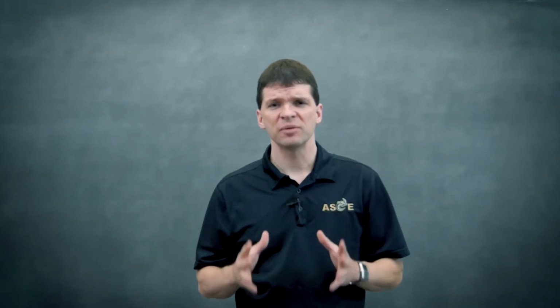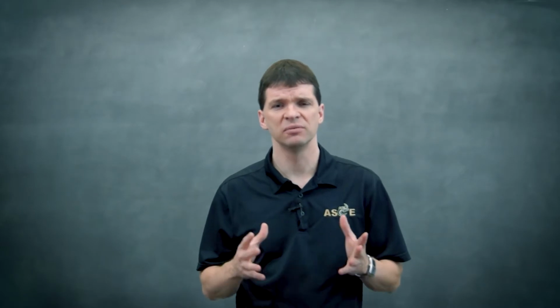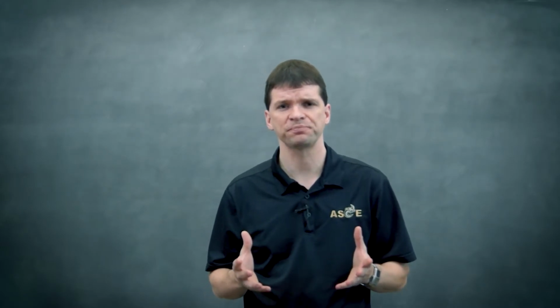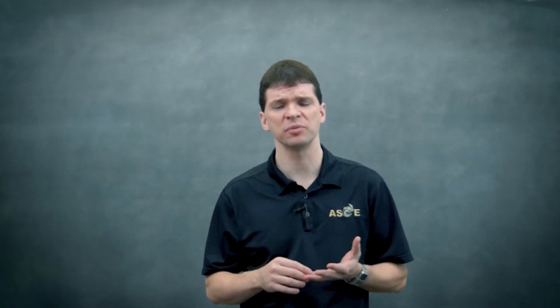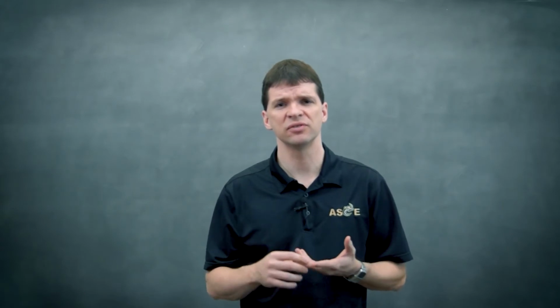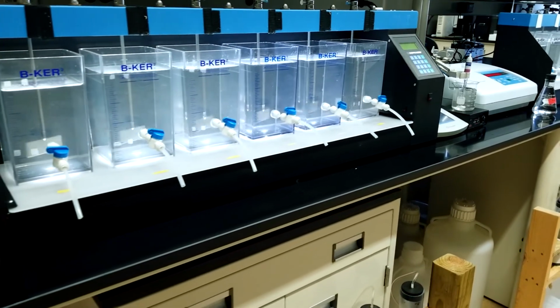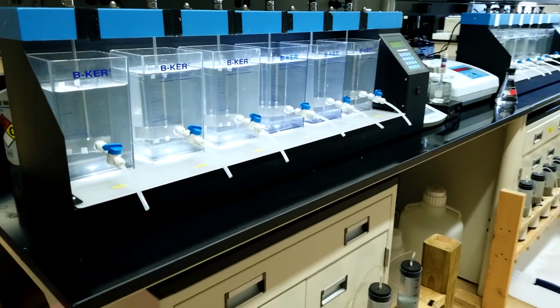The flaws include sedimentation. Not all water treatment plants produce a settleable floc that would work with the traditional jar testing method. For example, if the water treatment plant has a very low organic carbon concentration and a very low turbidity, it's very unlikely that you're going to produce a large settleable floc that's going to work with a jar test. Coagulation controls every process that comes after coagulation, like flocculation, sedimentation, filtration, and disinfection, because if particles are not properly coagulated, they won't flocculate, and if they don't flocculate, they won't settle, and if they aren't properly coagulated, they won't filter either.